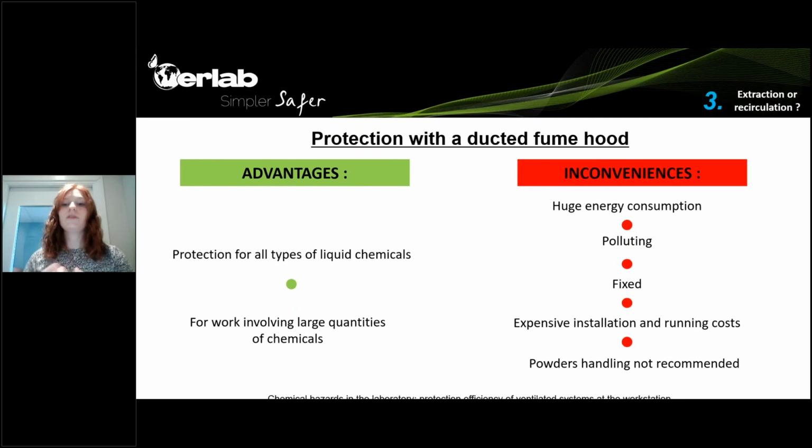It has expensive installation and running costs, due to the many devices around the ducted fume hood that need to be installed so that it works properly, as well as high running costs due to the high energy consumption. And finally, if powders need to be handled, it is not really recommended.